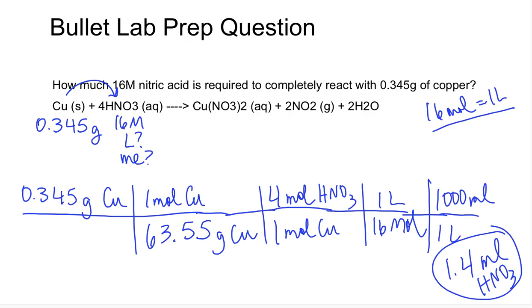It's a really cool reaction, though. We have to do it under the fume hood because it produces nitrogen dioxide, which is a very colorful brown gas that will, well, it's actually nitrogen dioxide. Change that. But it'll knock you out. If you don't, people who don't have fume hoods, they have to go outside to do this. Can't do it in a room. No, no. That would be remiss of me to let that happen.